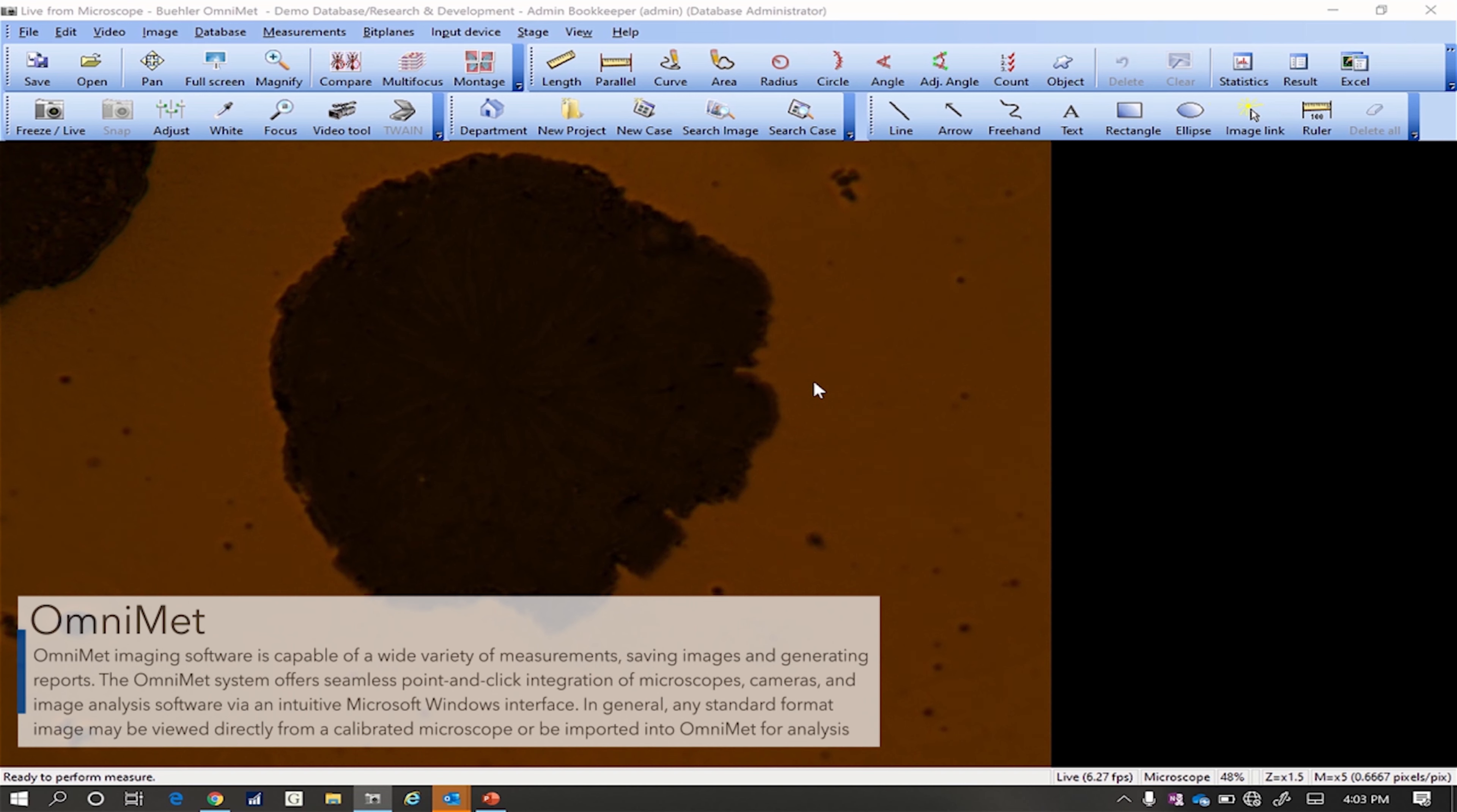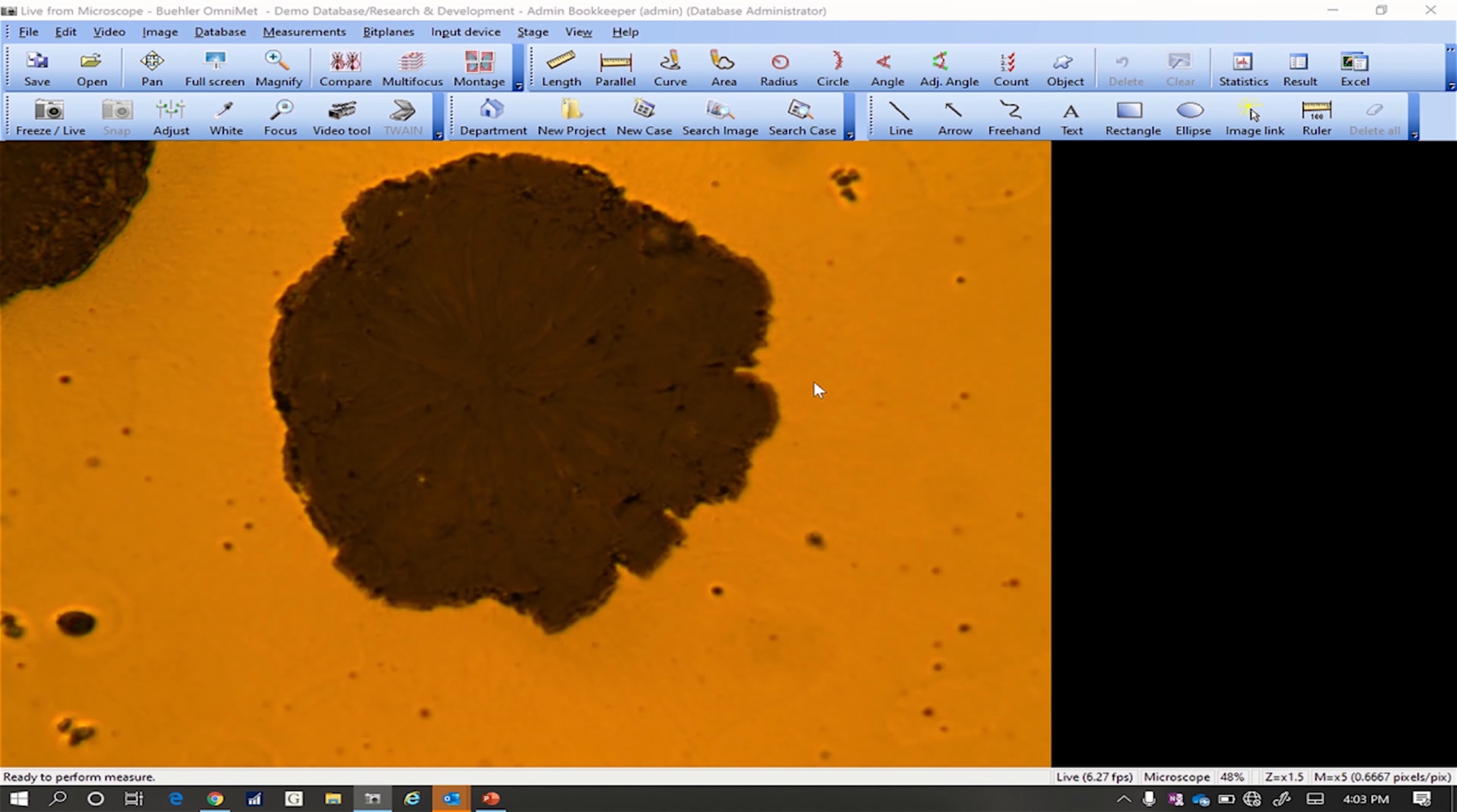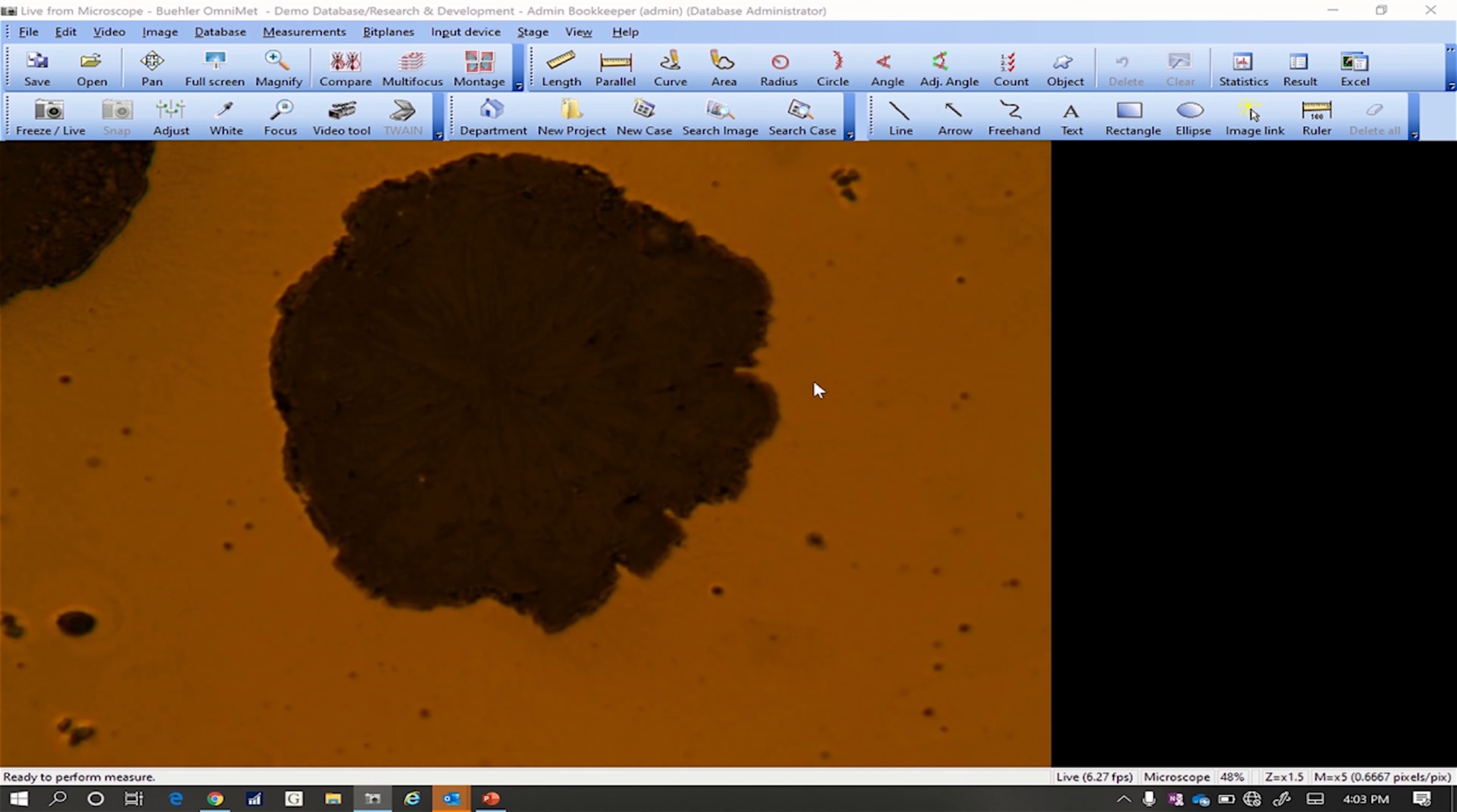Onion allows the user to modify a wide number of camera settings. If the camera settings are set incorrectly, color, contrast, and resolution of the image can be dramatically worsened. Also, response time of the camera may be poor. Returning camera settings back to default values can greatly enhance your image and ensure good representation of what is being seen down the microscope.